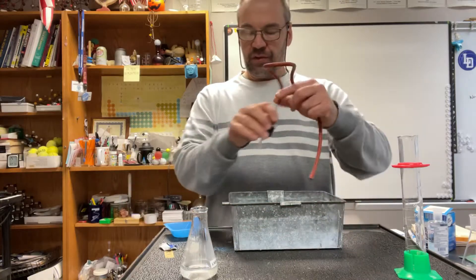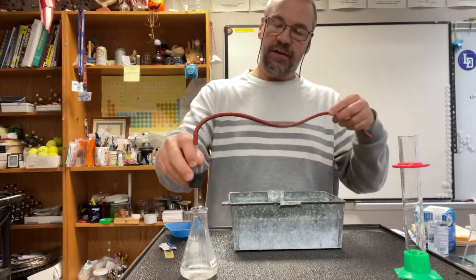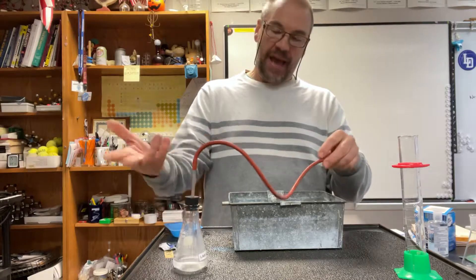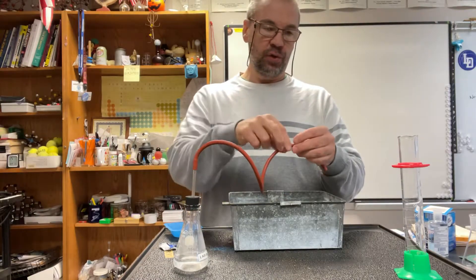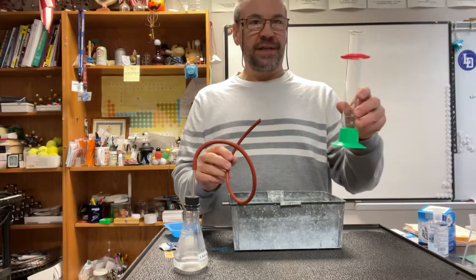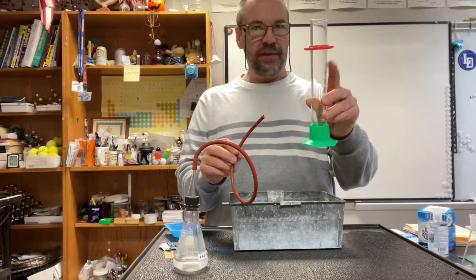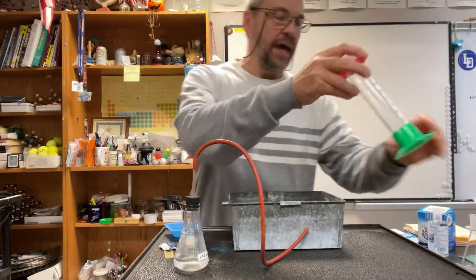So what happens is as soon as you put that Alka-Seltzer in there, you put the cap on, so any gas that's produced is going to go up this tube, and then what you want to do is collect it in your graduated cylinder.